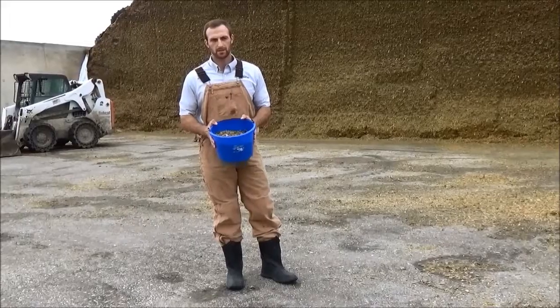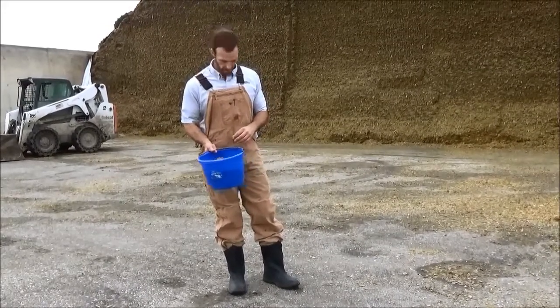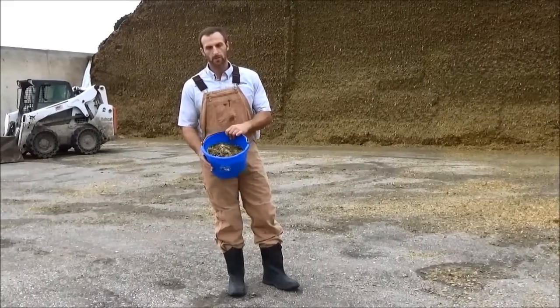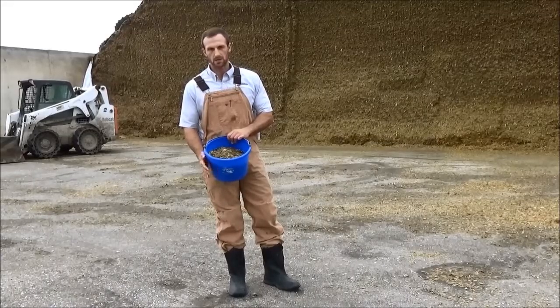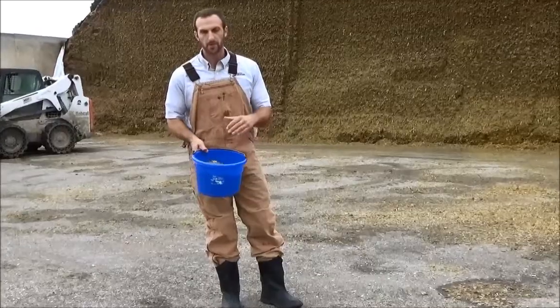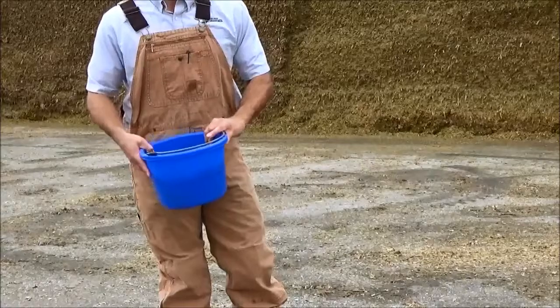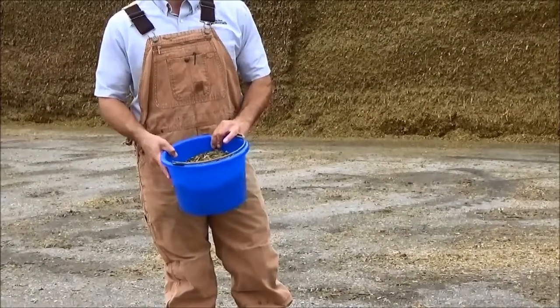Now I've got my accurate collection of subsamples — about half the bucket full here in this calf pail. We're going to go through accurately subsampling from this, because again we don't want to send all of this to the testing laboratory. We want to get a representative sample, so I'm going to turn the feed over, dump it out, and use a mixing and quartering technique to get the sample divided down into the quart-sized bag.